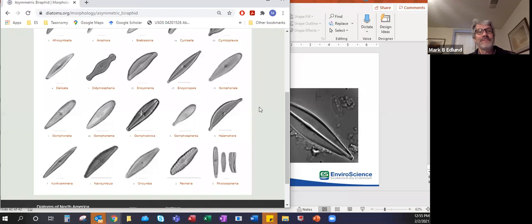While we wait for another question, I wanted to ask you a little bit. One of the things I noticed, not only did you use your microscope in your presentation, a first for us, thank you, but I'm curious, if you could give us a little bit of thoughts about the microscopes, not yours specifically, but as people who want to identify diatoms, what should they want to have available? How good should their scope be? Should they have that nice camera sitting on top? What kind of things are really important in terms of how we identify diatoms?